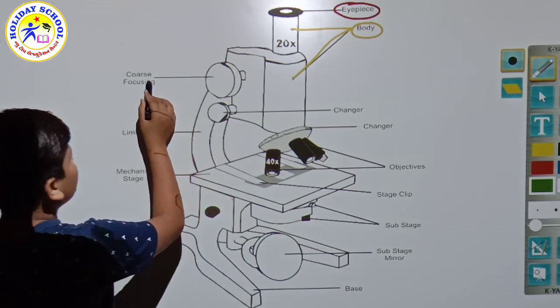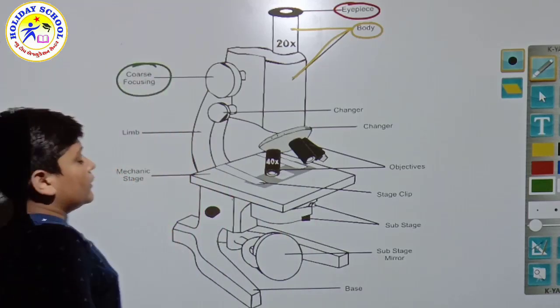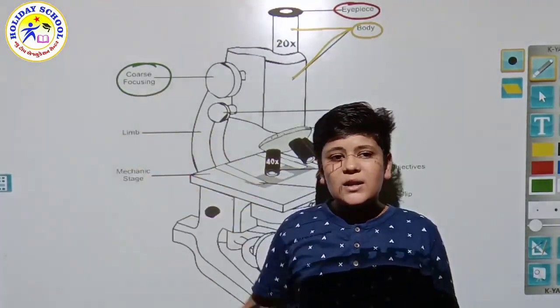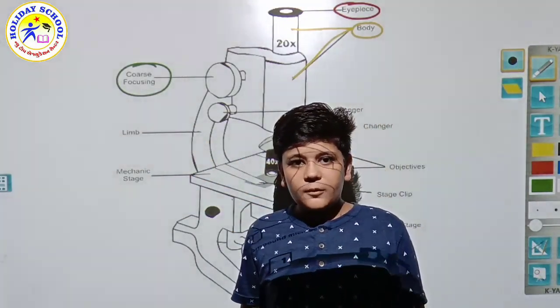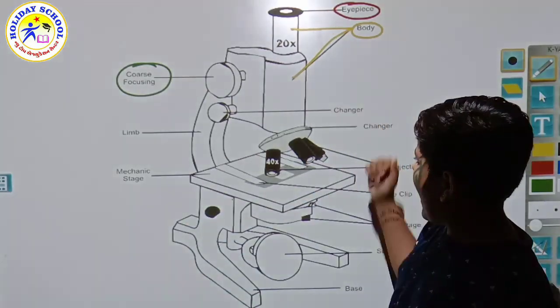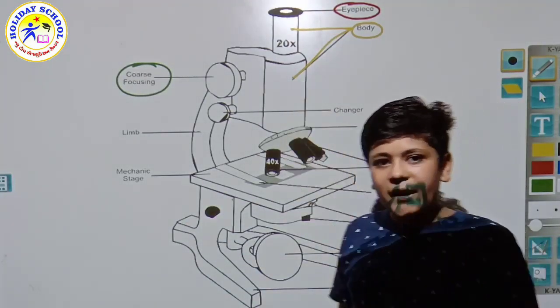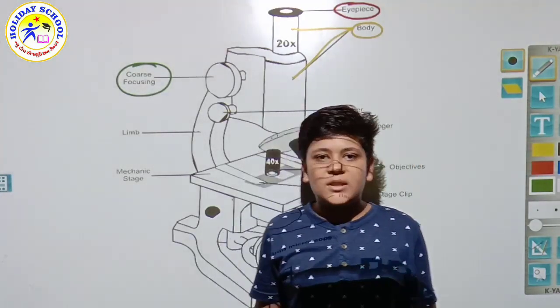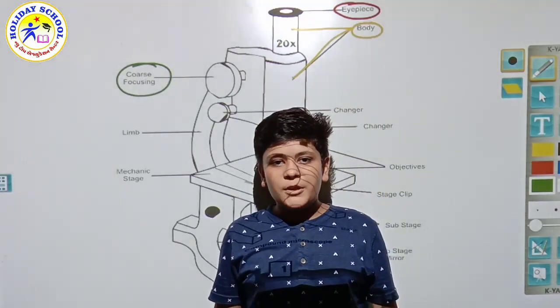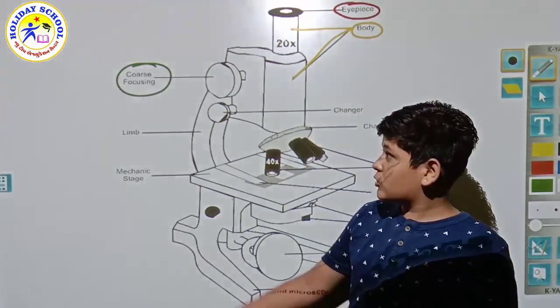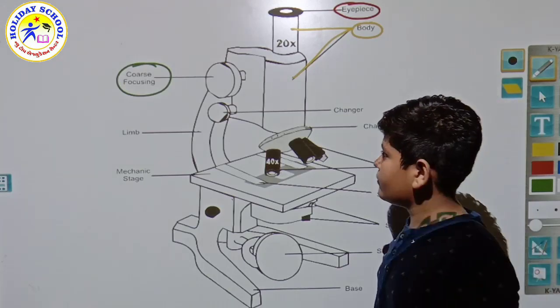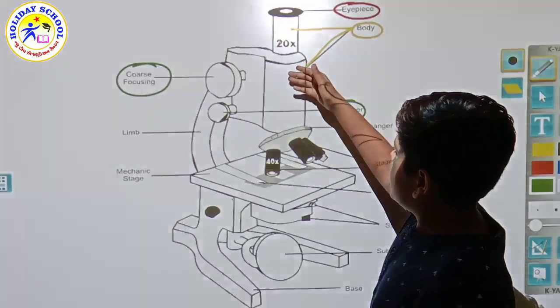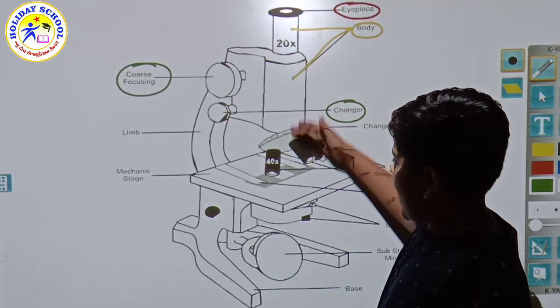Now let's see the coarse focusing. Coarse focusing means it focuses the quality - how much to zoom in or zoom out. You know that in mobile phones we have zoom. While clicking pictures, the clarity is not coming, so the clarity comes from this. This changes to move the body down and up.